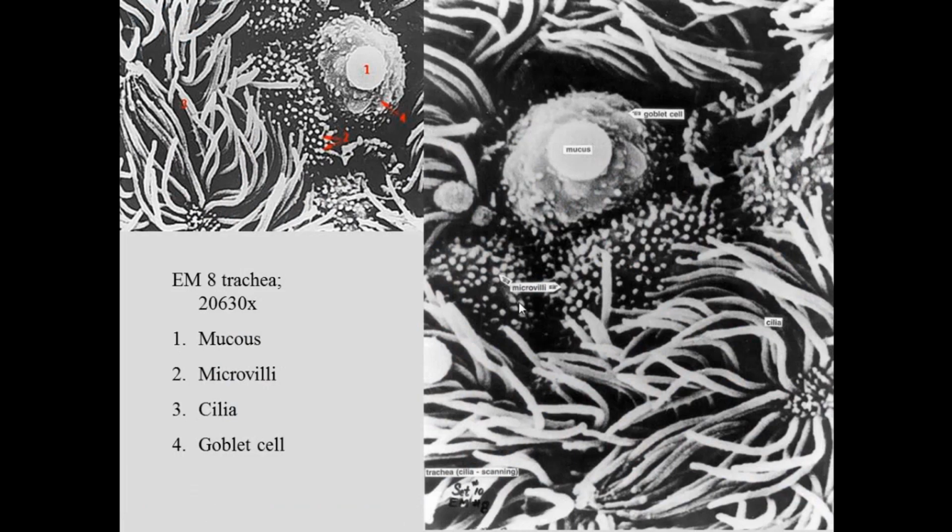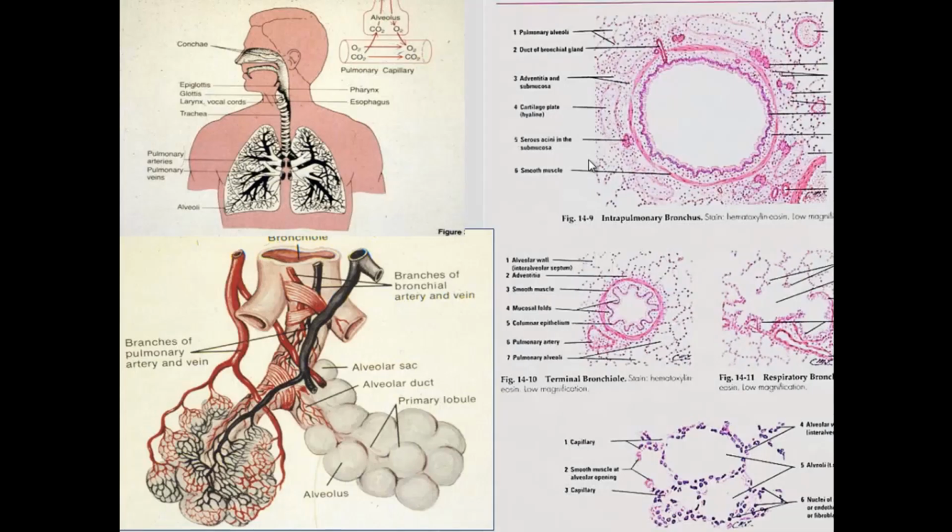If you look at the respiratory epithelium with the scanning electron microscope, you can see the ciliated cells, these are individual cilia in through there. You see microvilli on the goblet cells, and this is a mucus secretion of this goblet cell. You can see the secretion itself.